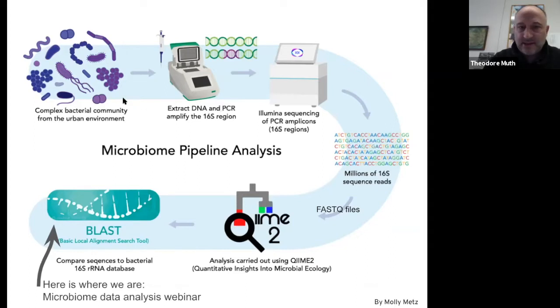Again, this is the microbiome analysis pipeline. And just to reposition everyone, we're starting over here on the lower right-hand corner with the FASTQ files. Some of you may have your own FASTQ files from your own data sets. There are data sets available from other sites, and we are providing the demo soil data sets for anyone to use during the workshop or on their own with your students and so forth. So everyone should have a source for FASTQ files.